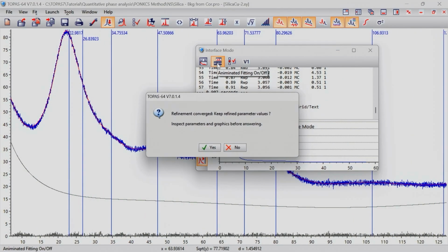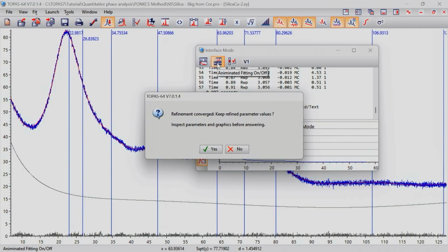The individual peak intensities and positions do not matter. So the bottom line, what I've got here with a couple of six or seven randomly put peaks is the same intensity distribution which I've done with a fully arbitrary, unphysical Pawley fit. Yes, please.